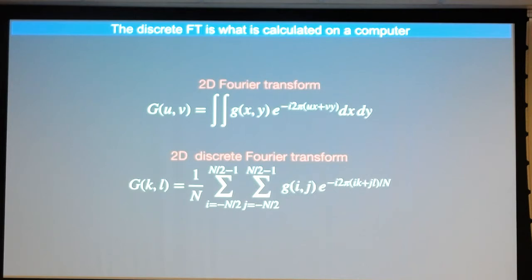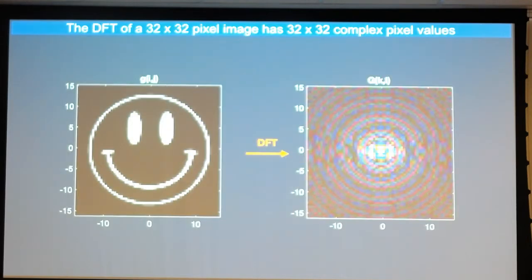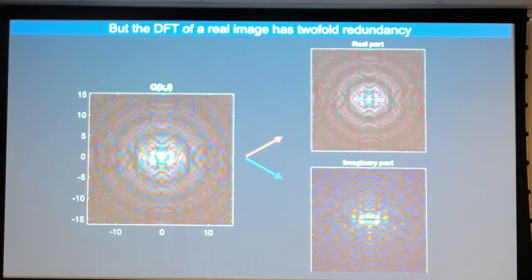There's something called the discrete Fourier transform, and that's really how I did these calculations on the computer. You might have the question: I just take a grayscale image that is 32 by 32, and I compute its Fourier transform, and it's 32 by 32, but it has a phase angle at each pixel, you know, it's this colored thing. And so where did the information come from?